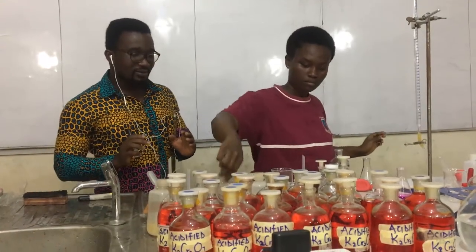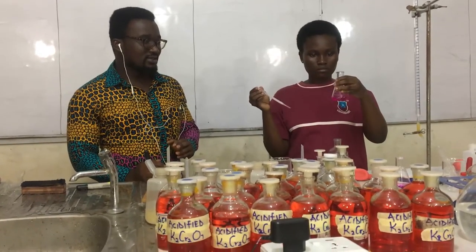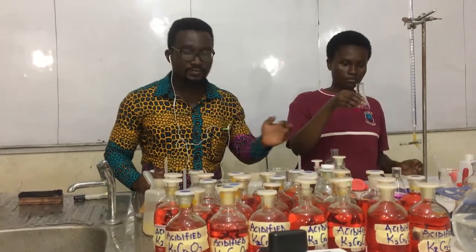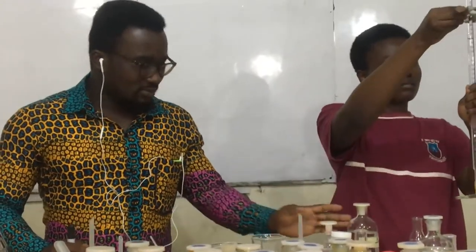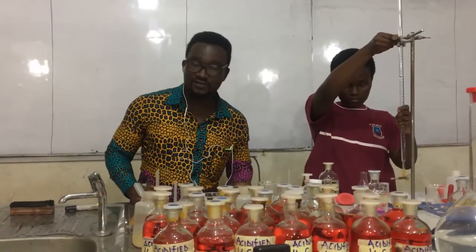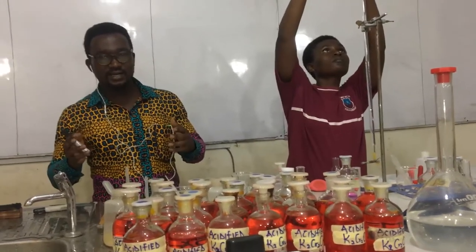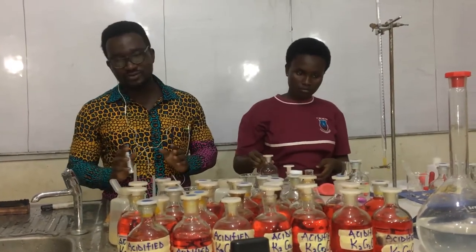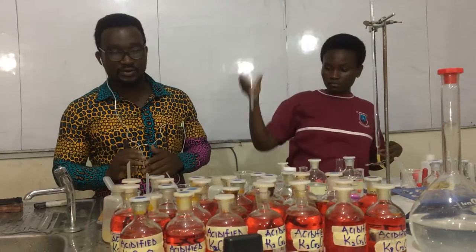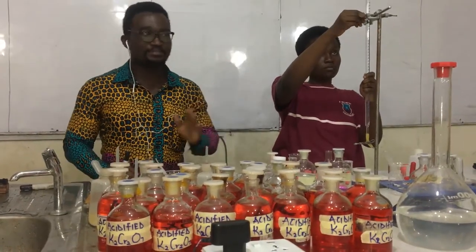So she has also finished with the portion that she's supposed to pipette, and then the few drops she has added into it. You can see the color pink. So this indicates that the pH of the solution is within a certain range. That is why solution B, as it was pipetted into the conical flask, is showing a pink color. We have already discussed the colors of the various indicators in the various solutions. So this time, she's stopping up. She doesn't want any trouble. She just wants to eliminate certain errors as soon as possible. Therefore, I can see that she has stopped it up.